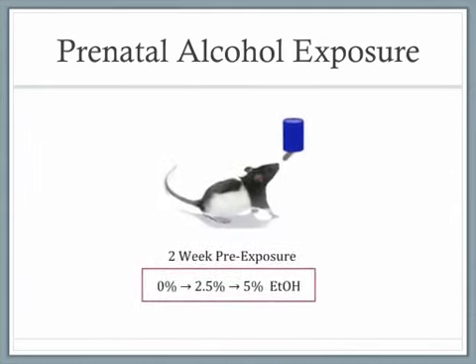In order to evaluate pre-pregnancy drinking levels, the female rats voluntarily consume saccharine water containing incrementally higher concentrations of alcohol over a 2-week period. The function of this evaluation is to identify rats that drink at desired levels for subsequent phases of the drinking protocol. This aspect of the alcohol exposure paradigm also ensures that all female rats have experienced drinking prior to pregnancy.